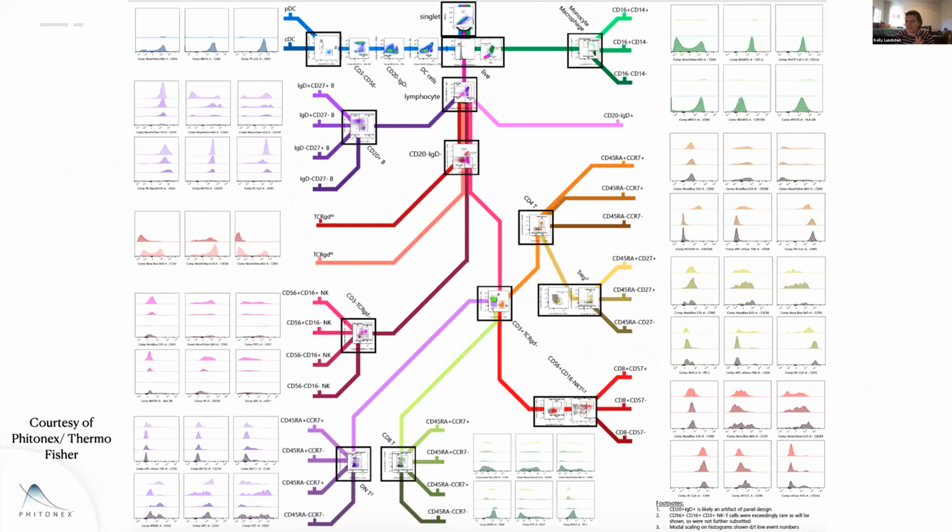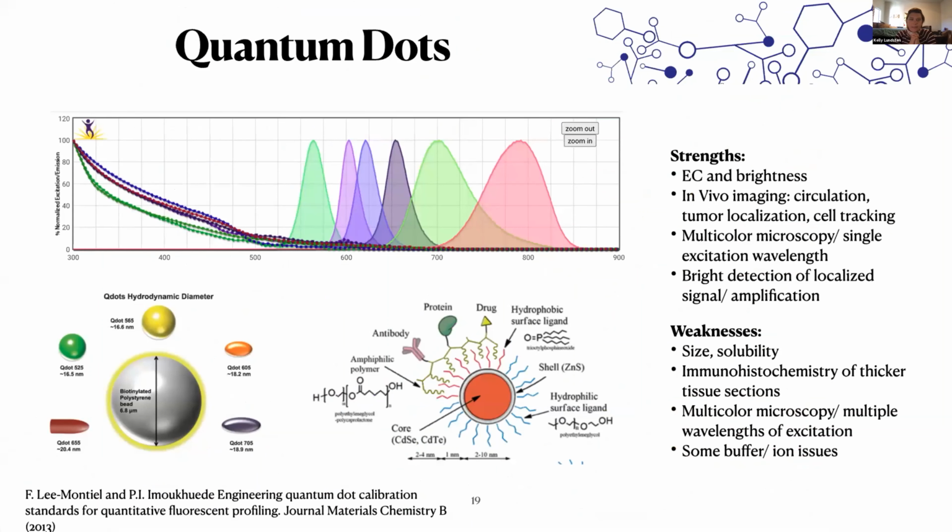They have some interesting ways of displaying their data, because for us in flow cytometry, getting up to 40 parameters becomes about data analysis. I don't want to do 2x2 parameter bivariates over and over and over again. I may never find the thing I'm looking for if I do it that way. So we have to have more intelligent algorithms to do data analysis. I certainly don't want to do what they did here with 40 parameters. That would take like a year.